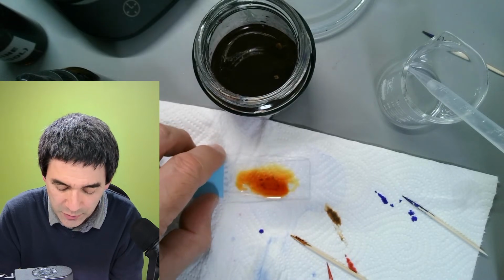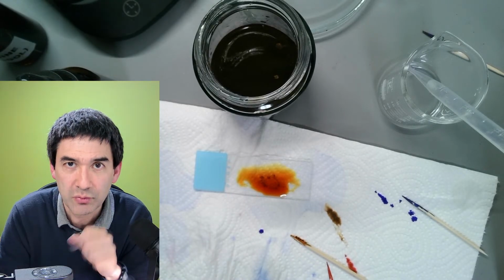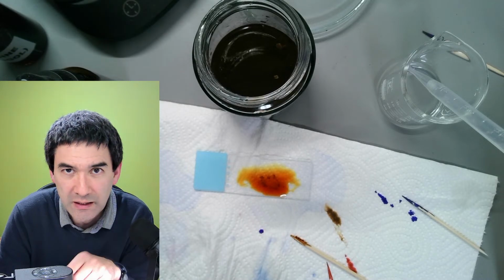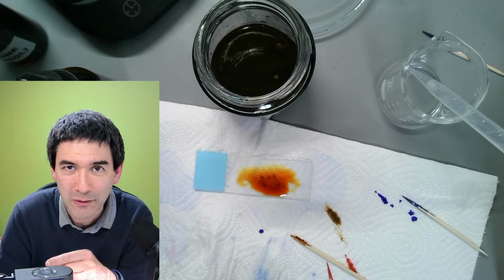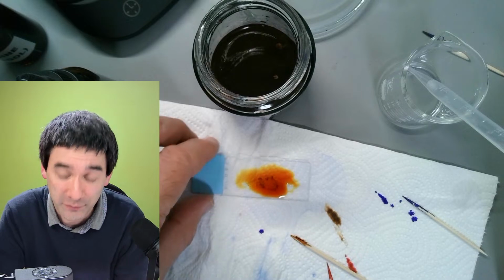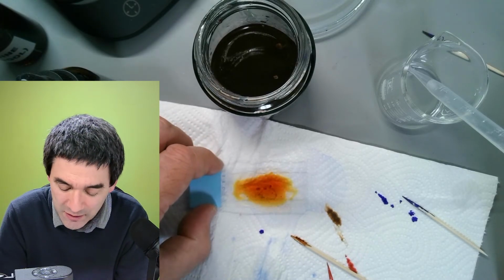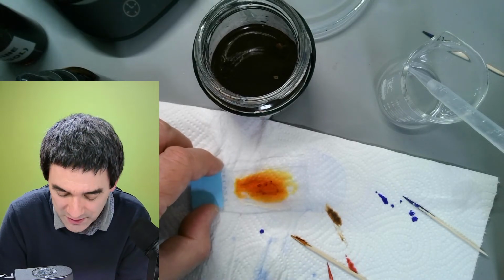If this actually were to work now, if I'm able to see some gram-positive cells, bacteria in here, that would indeed be a very nice demonstration to see how you're able to make the bacteria visible and not the body cells, right? Essentially, this was the original intention of Gram back in the 19th century, to selectively stain the bacteria so that you can see them better compared to the remaining body cells.